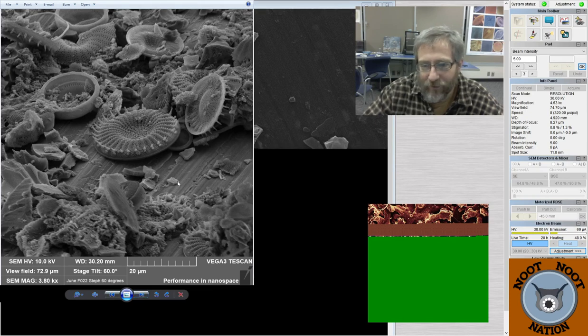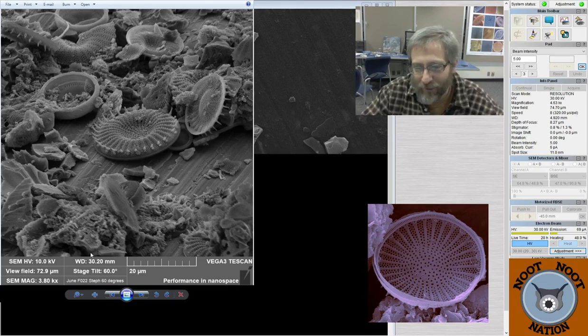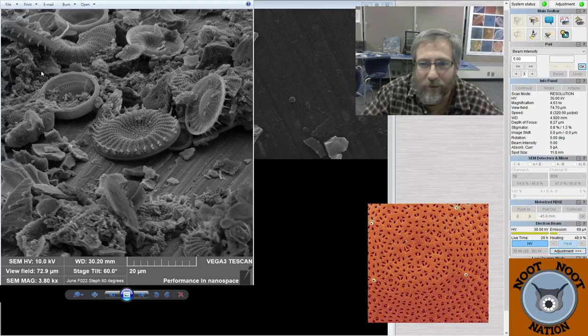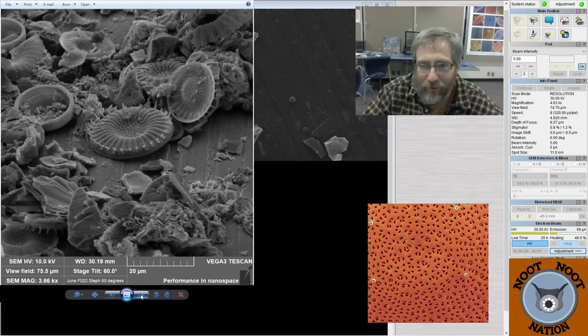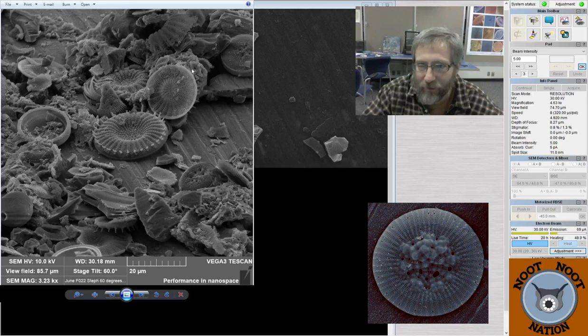You can see at 60 degrees, it looks a lot more like a cemetery of dead diatoms everywhere. A landscape, right? Because when you get really low on it, you start to actually see the landscape of the stub, and it's a pretty neat view right there. It's like looking at all of the material, and these things are another diatom that probably need to be described. That's a chrysophyte. These ones are the same thing. These are the same species, the Stephanodiscus that I've described as coruscus.